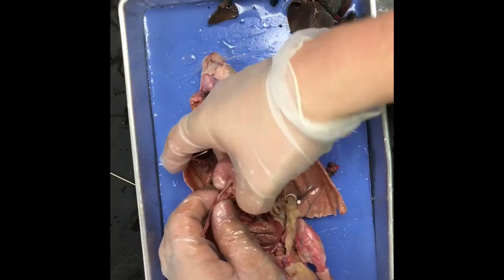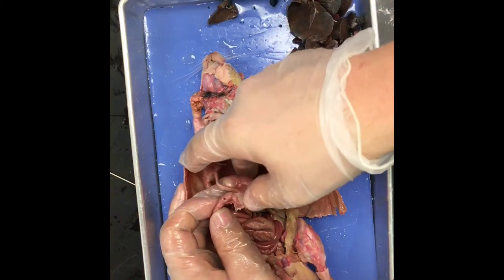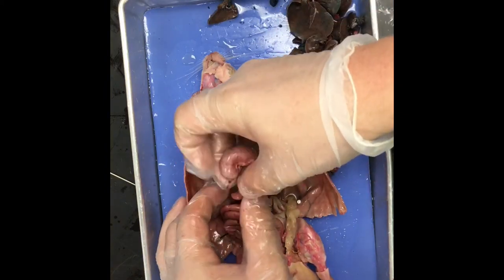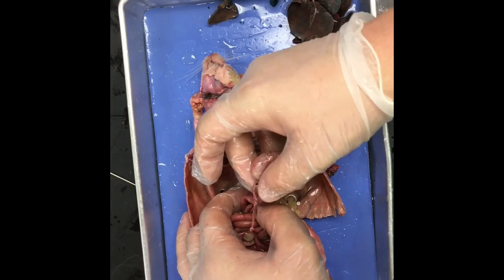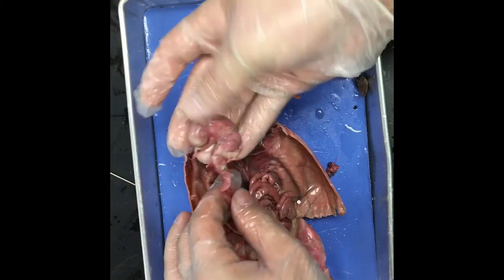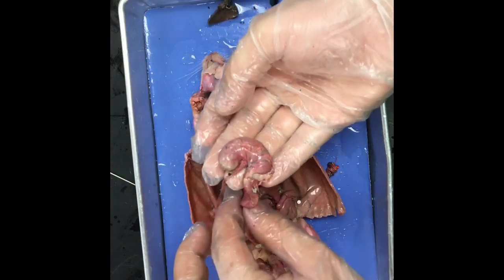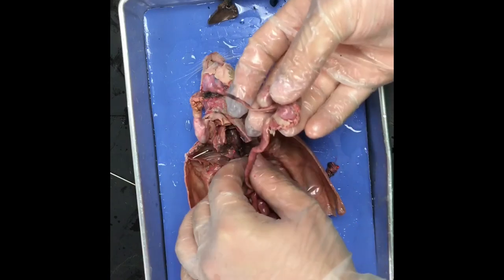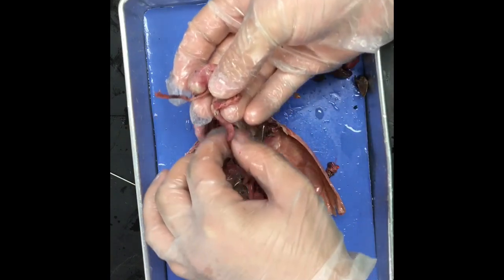I'm going to trace you guys all the way through the digestive system. It's very solid, very hard. Very mushy. All right, so this is the stomach. Here's your esophagus leading down into it. What comes after the stomach? The intestines. Small intestines. So thin and long.